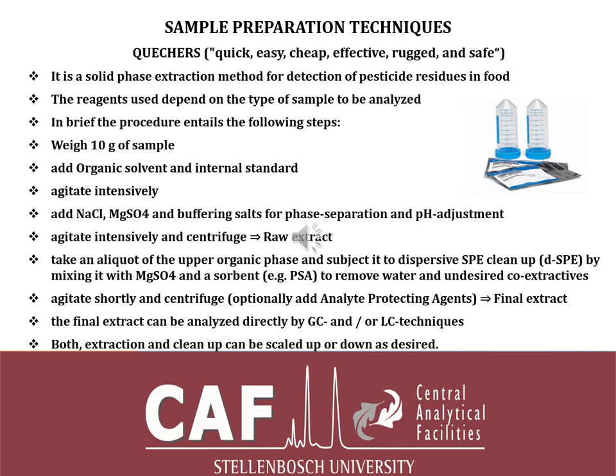By introducing the hexane, we also improve the sensitivity of the sample prep, because sometimes when you speak of sensitivity, people think it's only instrument related. They forget that the instrument can only give you what you have injected. Before you want to speak of the sensitivity of the instrument, one needs to make sure that you've already exhausted everything that you possibly can on your sample prep.